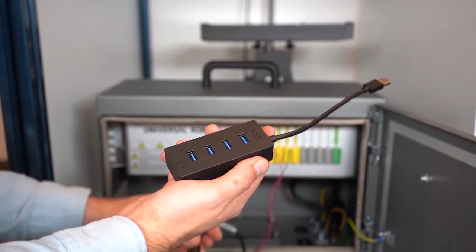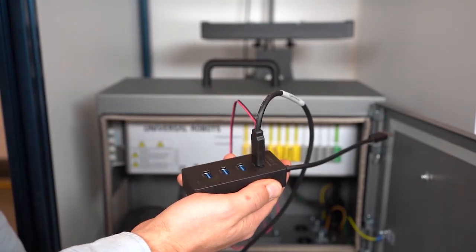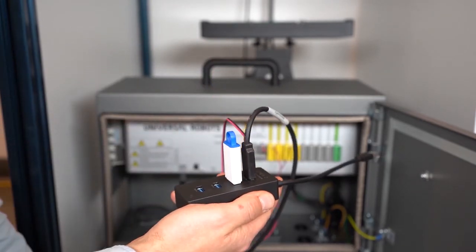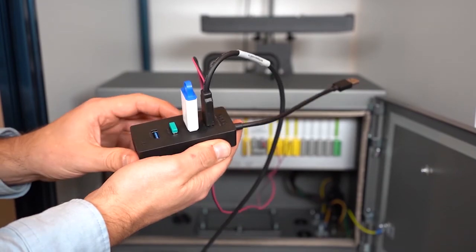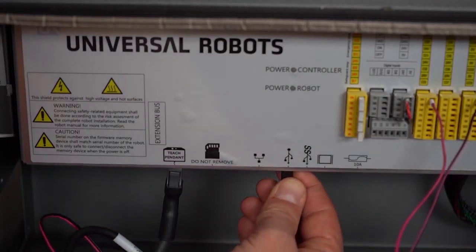Connect the USB cable to the 4-port USB hub. While you are at it, pick up the USB storage device containing the Vision Server and UR cap, as well as the Vision Server's license dongle, and connect them both to the 4-port USB hub. Now plug the 4-port USB hub into the robot controller.